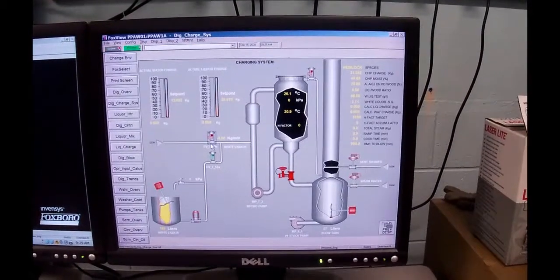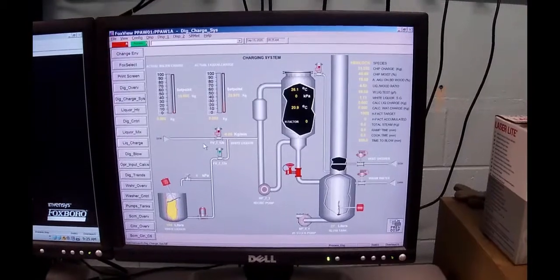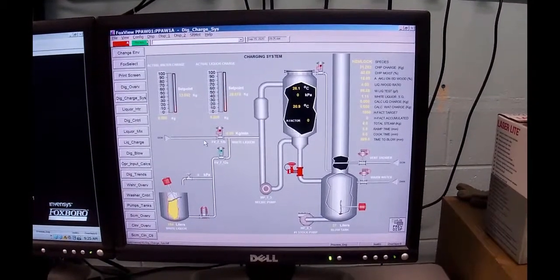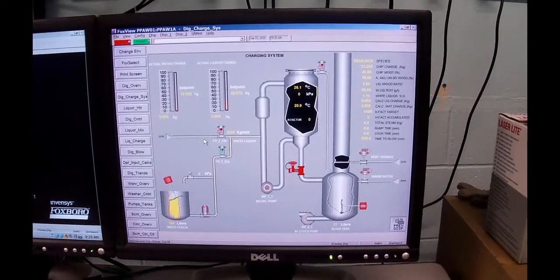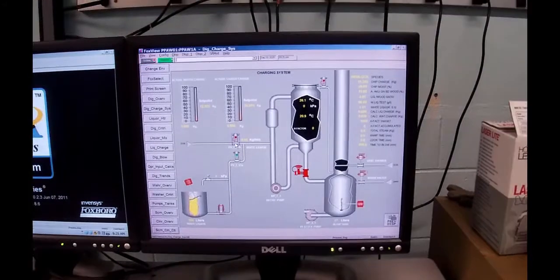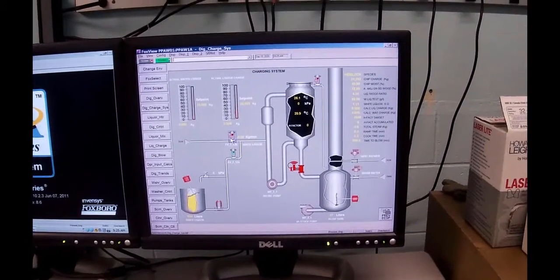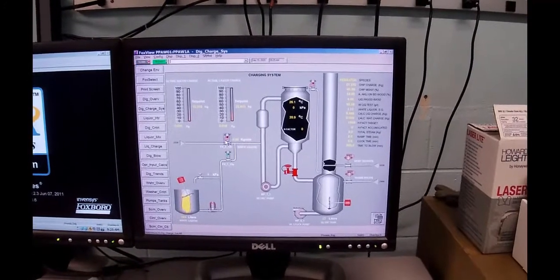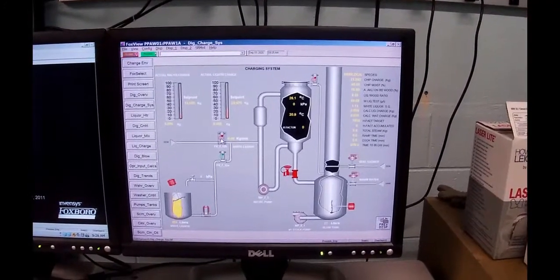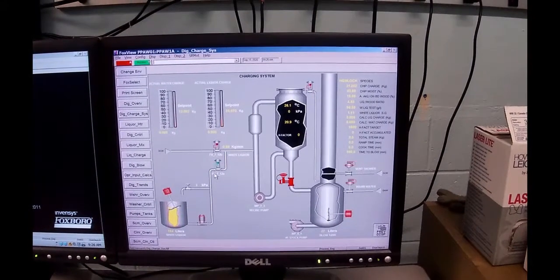Now, basic chemistry. Do you add acid to water or water to the acid? Well, the answer to that is you add the acid to the water. And the reason for it is that it's exothermic. It'll generate a lot of heat. If you put the water into the acid, it will generate heat in the acid, and you'll end up with it splattering and coming out all over you. So we want to put the water in first, and right now we've selected the liquor.